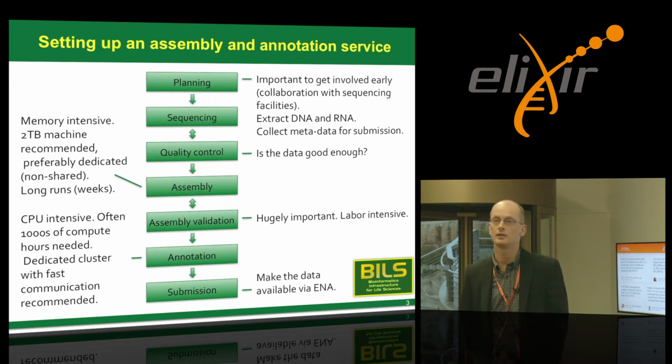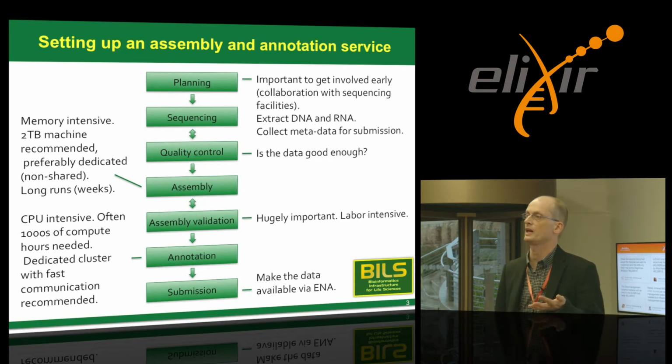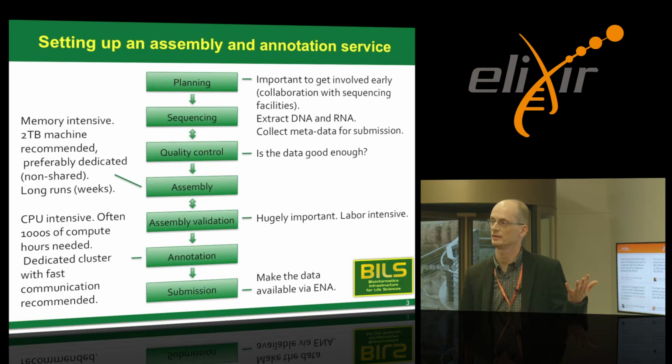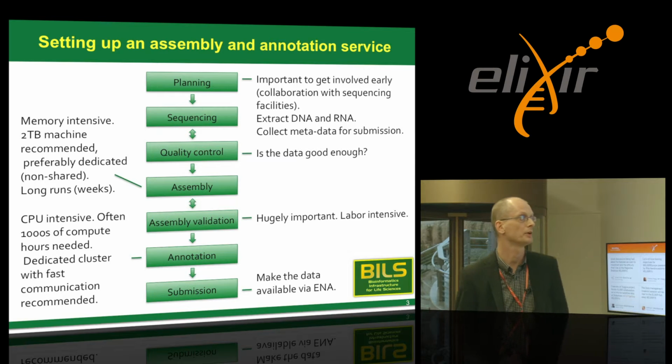Assembly validation is then hugely important. This is more labor-intensive. Is the assembly I have good enough, or do I need to go back and do this repeatedly, which is usually the case. That's why I have a 2 pointing arrow there also.